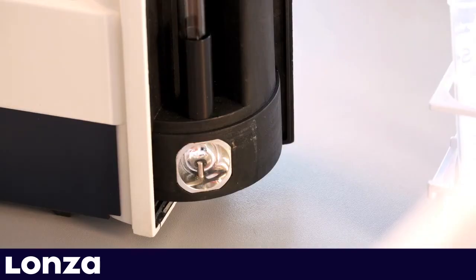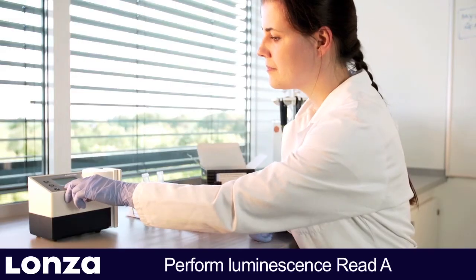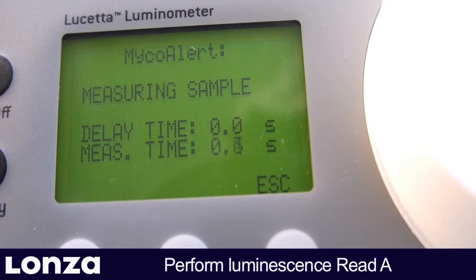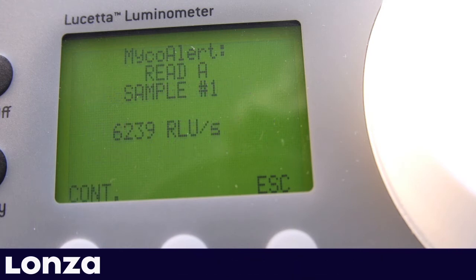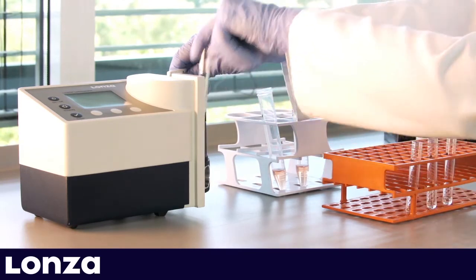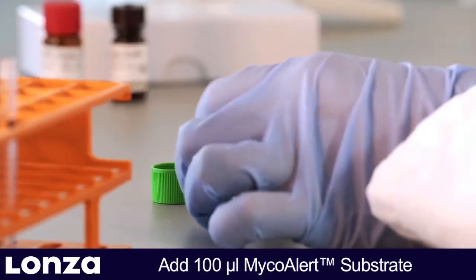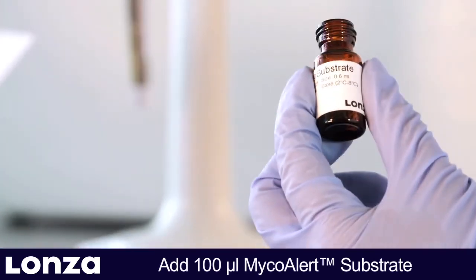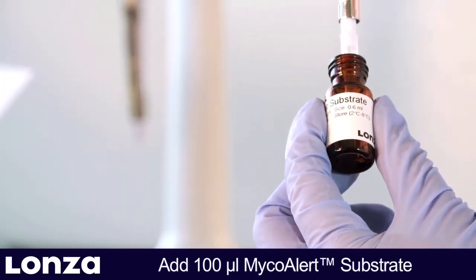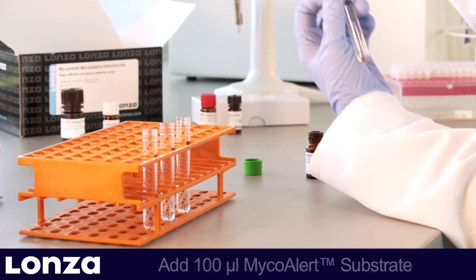For measuring background ATP levels, insert sample tubes into luminometer and perform luminescence reading A for all samples. Add 100 µL MycoAlert substrate to each sample and incubate for 10 minutes, allowing the generation of additional ATP in case mycoplasma are present.